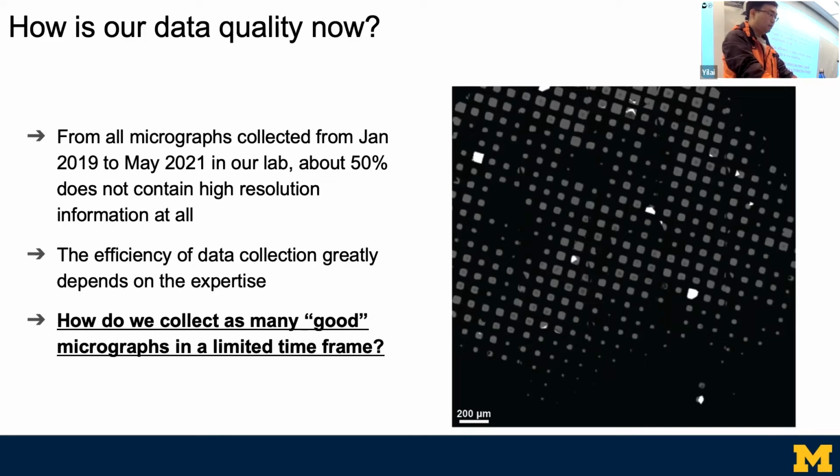And the question is, how do we collect as many good micrographs as possible in a limited time frame, and preferably without an expert steering the microscope, so anyone can just start the data collection and there will be an algorithm to collect as many good micrographs. I didn't mention it here, but some of you might know that cryo-EM is a very expensive technique. The scope itself costs a few million dollars, and installing costs another few million. And to keep it running, if you combine all the costs, the cost is around a few thousand per day. So efficiency and automation are needed in this field.